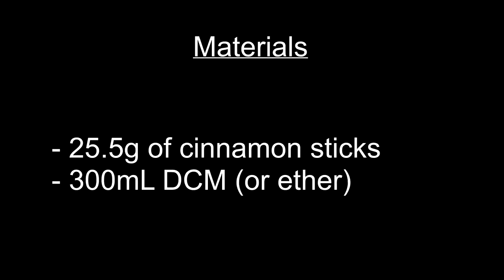For this experiment I used 25.5 grams of cinnamon sticks and about 300 milliliters of DCM. However it should be noted that almost all of the DCM is recycled and recovered at the end.